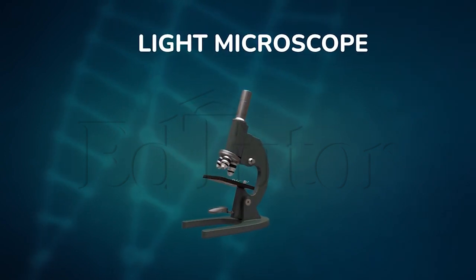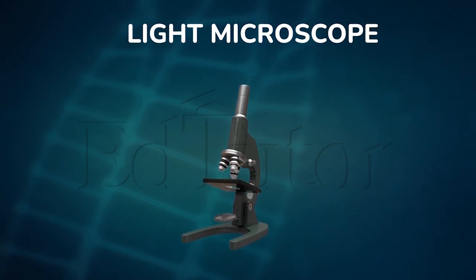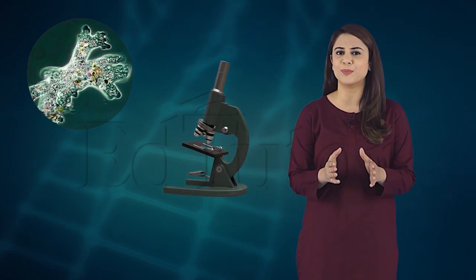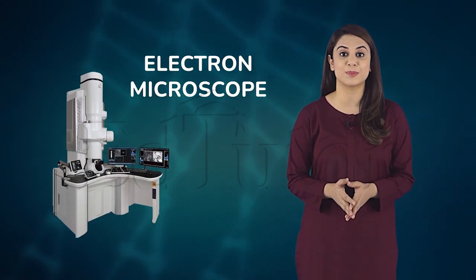But this is when our light microscope enters the game and says, I can easily observe living cells. Look, here's me observing the movement of alive amoeba in water. But let's get back to electron microscopes, shall we?